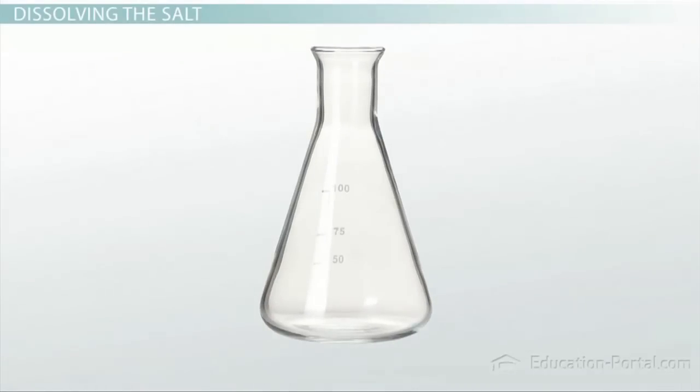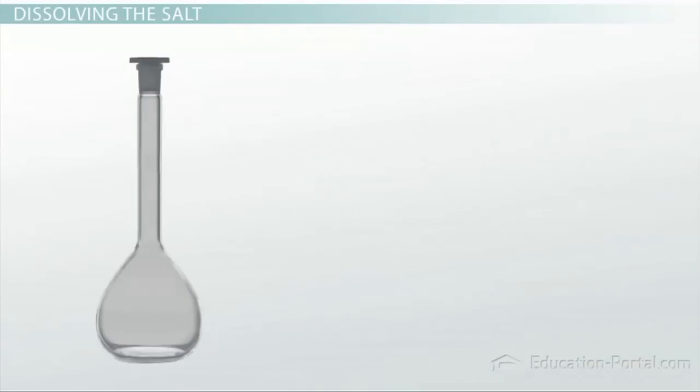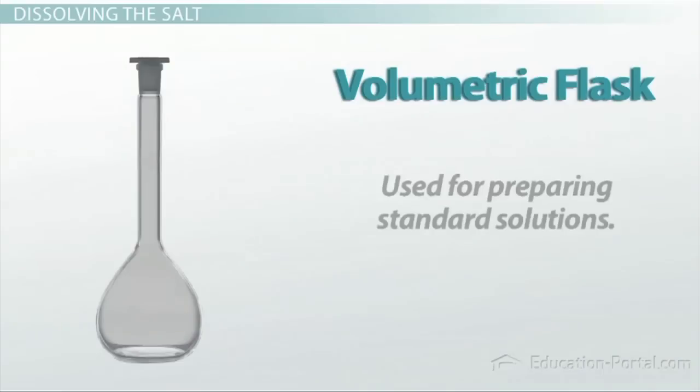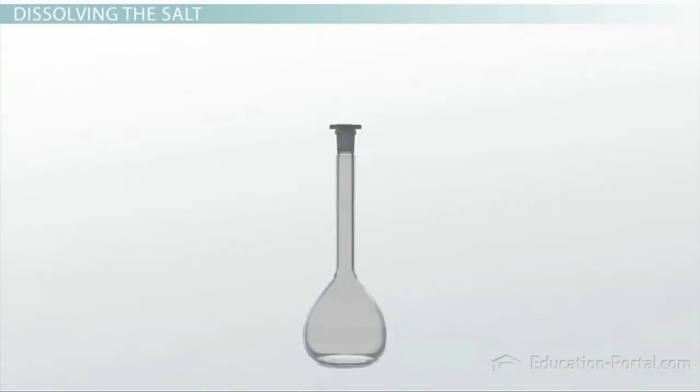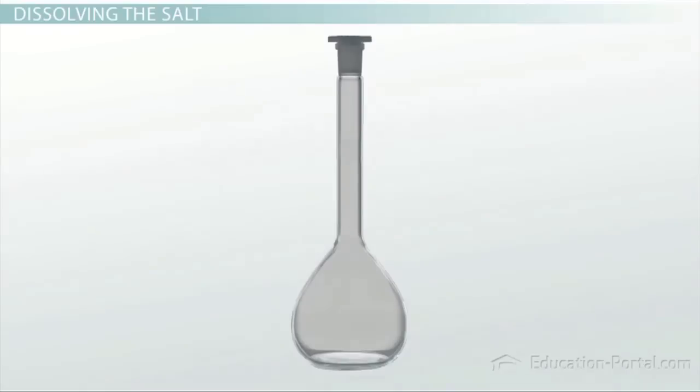Okay, now our salt is completely dissolved in the water we added, but we would like to make a 500 milliliter solution. The best piece of glassware for this job is the volumetric flask, which is used for preparing standard solutions. The bottom is great for dissolving or mixing liquids, and the narrow neck is perfect for the precise measurement of a liquid. We start out by pouring our concentrated salt solution from the Erlenmeyer flask into the 500 milliliter volumetric flask, and then filling it up to the line on the neck. What we have created is a 2 molar salt solution. We'll get to molarity in a later lesson.